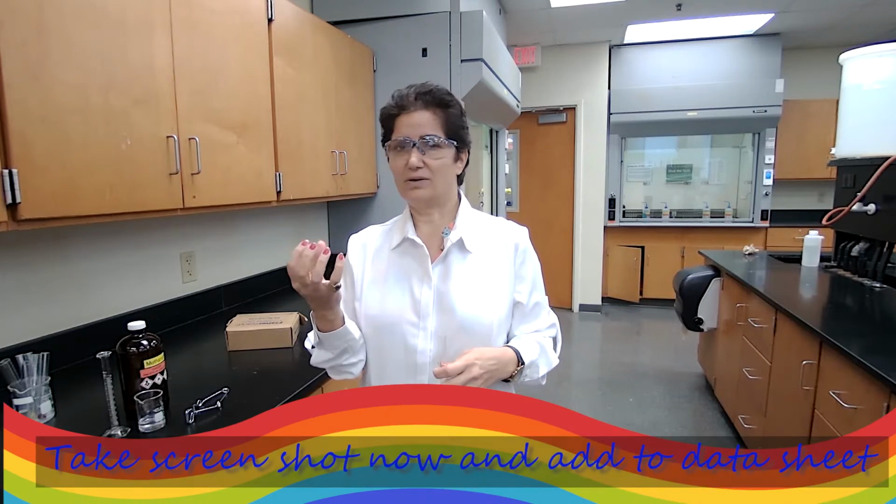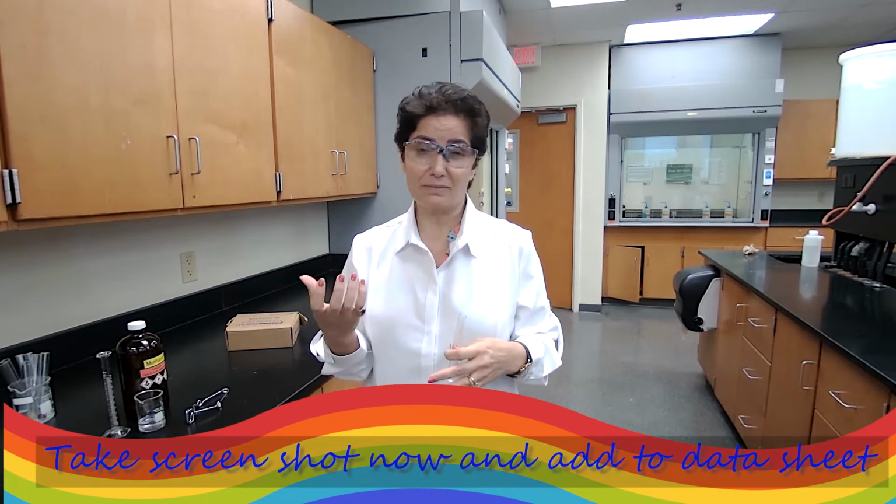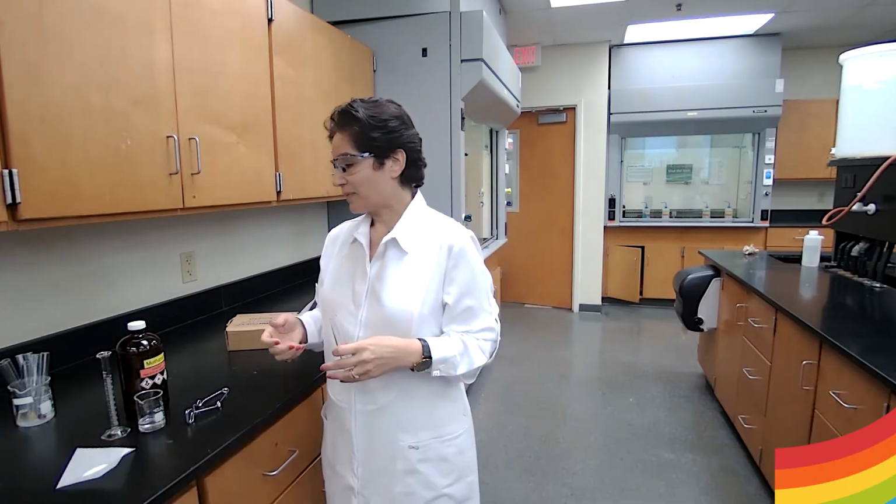The mixture that we are testing today is going to give a spearmint odor, like the oil of wintergreen, which I'm going to test.